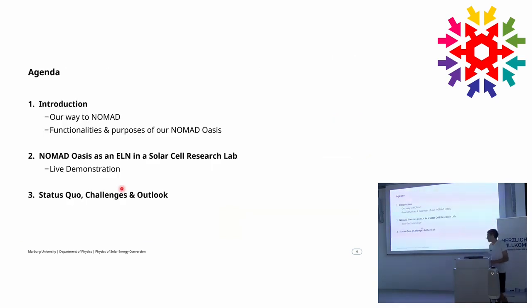The agenda for today: first, I would like to show you how I got to NOMAD and what the purposes and functionalities of our NOMAD Oasis deployment in Marburg are. The second part will be a live demonstration, so we can really show you what our workflows look like in the NOMAD Oasis user interface. In the end, I will tell you about some challenges, the status quo, and the outlook, so what may be there in the future. Then I'm happy to take some questions and have a nice discussion.